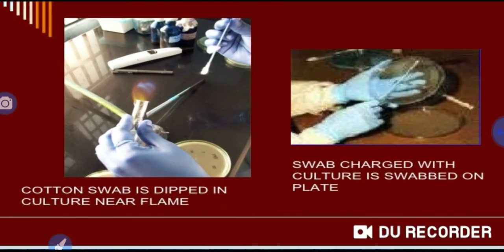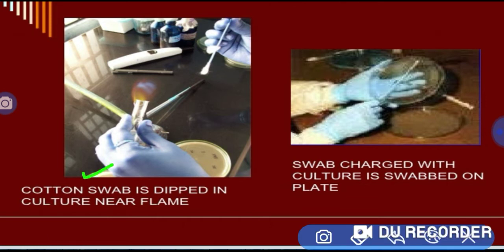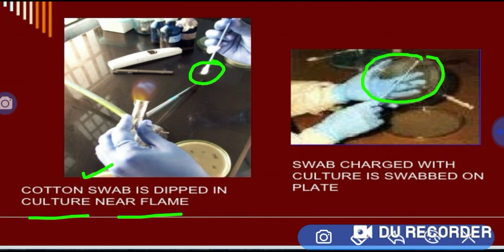In this method, we use a cotton swab or earbud. Near a flame, we first flame the bottle neck so that contaminated bacteria will die and the area is sterilized. Then the swab is charged with the culture, and we wipe or swab the surface of the plate — we first soak the swab in culture and then swab the plate.